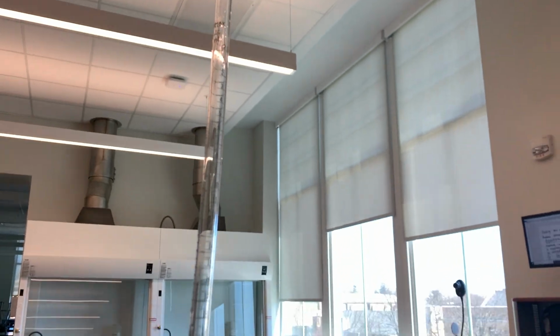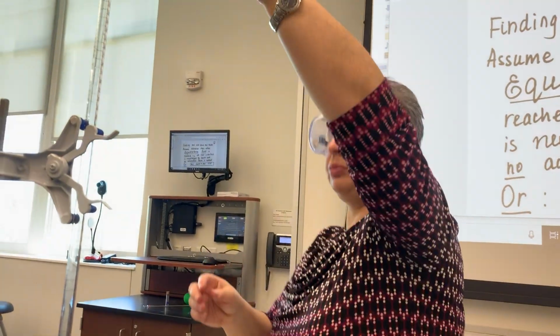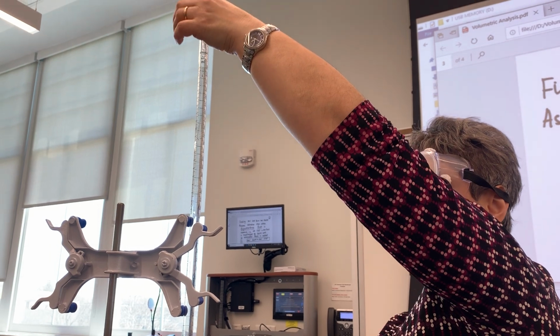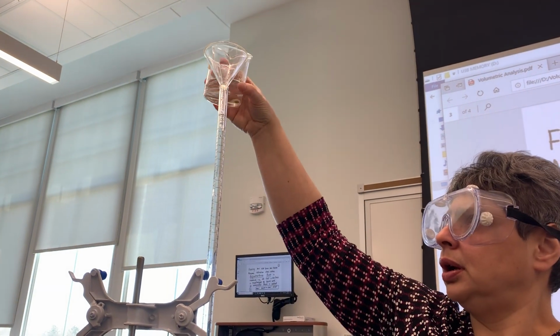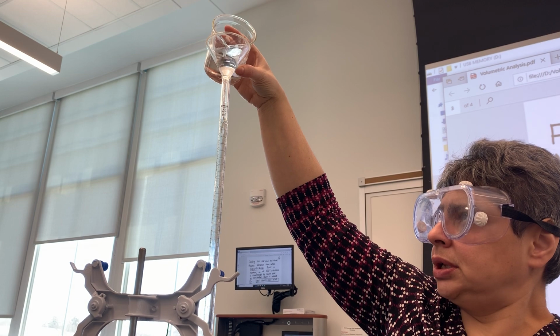So what I'm going to do is I'm going to put my goggles on here, and then I'm going to lower the burette since I'm short, so I need to lower it so I can reach. I'm going to place a funnel on top of the burette, and then I'm going to pour the liquid into it.